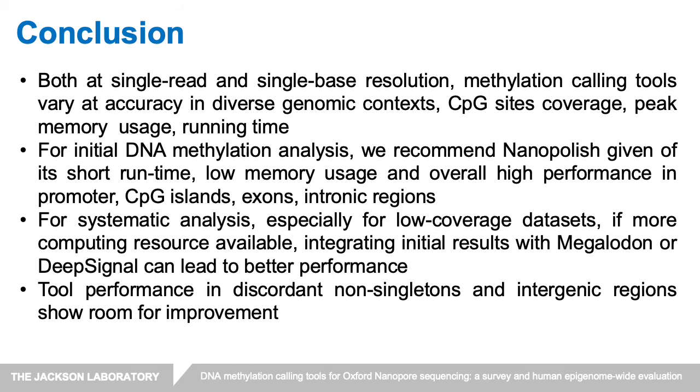To summarize, the performance of methylation calling tools varied in diverse genomic contexts, CpG site coverages, and running resources at both single-read and single-base resolution. For initial DNA methylation calling, we would like to recommend Nanopolish since it can achieve high performance with a relatively short running time and low memory requirement.